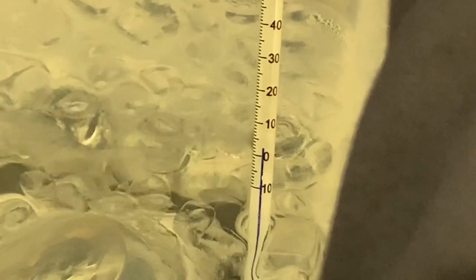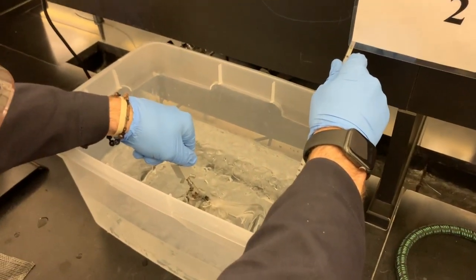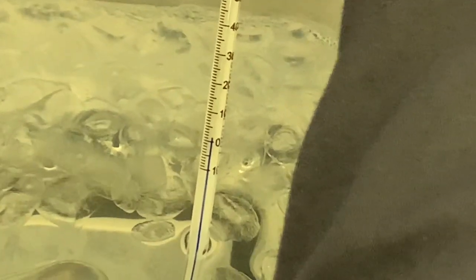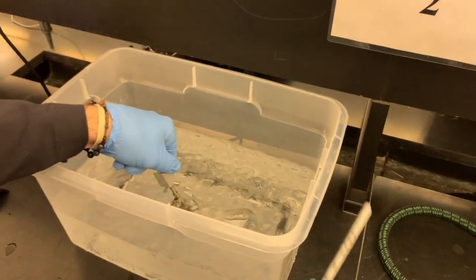Remember that you don't want to be doing anything that's going to be jiggling this and potentially knocking off the tip because that can cause a lot of problems. Specifically, it can make you have to do everything all over again. So keeping it steady is critical. And the temperature seems to be sitting at about 1 degrees Celsius. So I'm gonna do 1.0. And we're gonna call that.